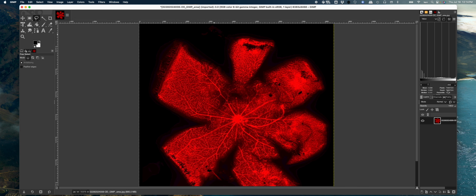You'll see down here there's a pixel and count. That number is telling us right now that on this layer we're looking at, and the border of it has dashed yellow lines, that's the area actually of that image. It's up in the 70 million pixel range.